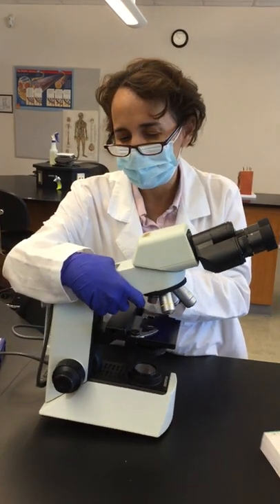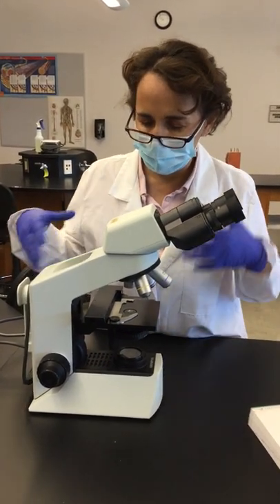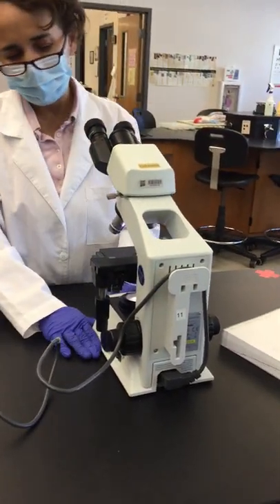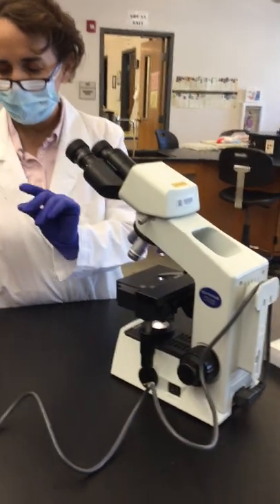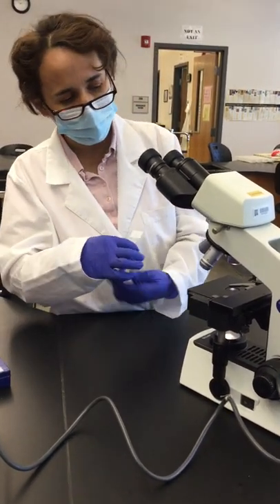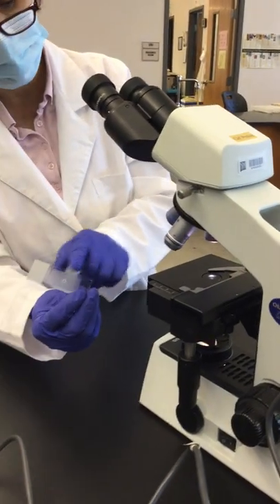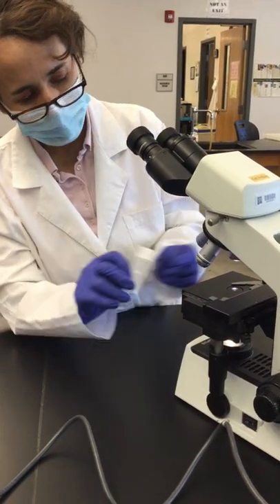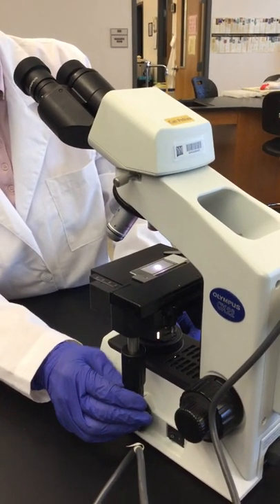Now let's start the exercise — how to turn on the microscope and begin focusing. Turn on the light. When grabbing slides, handle them by the edge so you don't touch the slide surface, then put them onto the stage. Once placed, position the area of interest — in this case the letter E — over the light coming through, move the stage clips to center it.